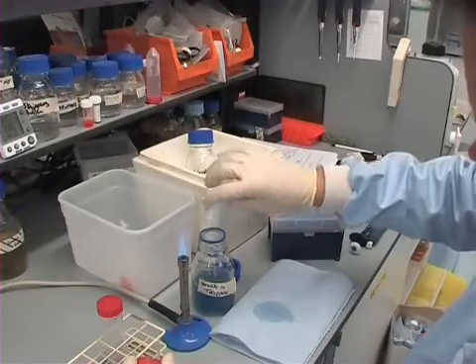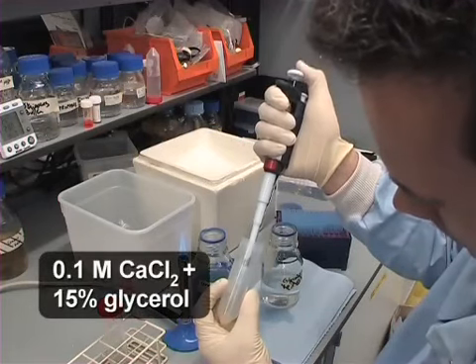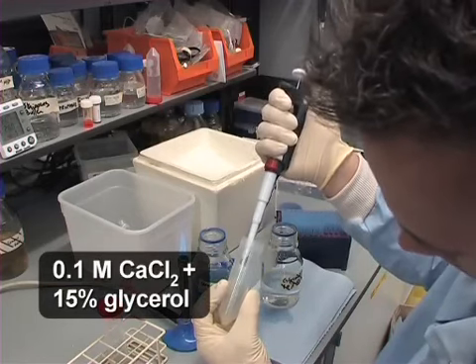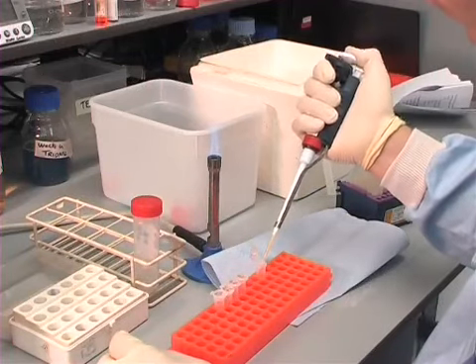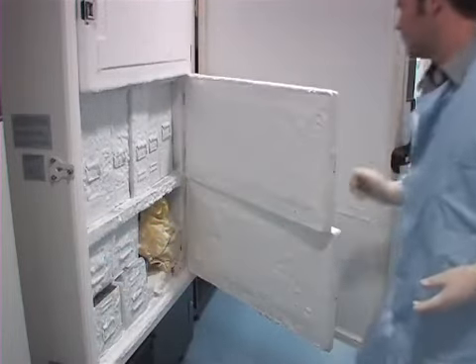After the final wash, resuspend cells in a cold 50 milliliter 0.1 molar calcium chloride plus 15% glycerol solution. These cells are now chemically competent. Distribute 50 microliters of bacteria into multiple microfuge tubes and store at -80 degrees Celsius until ready for heat shock.